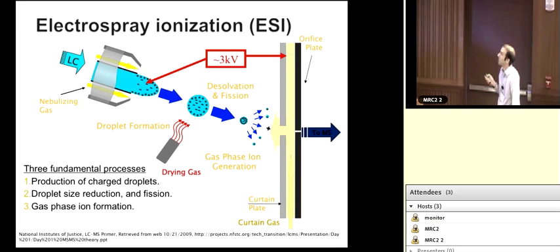But electrospray ionization is a technique that's very commonly coupled to liquid chromatography, and Steffi can tell you more about that side of things. But it works very well because it can make ions out of the liquid that's coming off of your chromatographic column. Almost everything can be separated by LC. There's a few things that can't, but it's a very good way to directly couple your separation method to mass spectrometry.